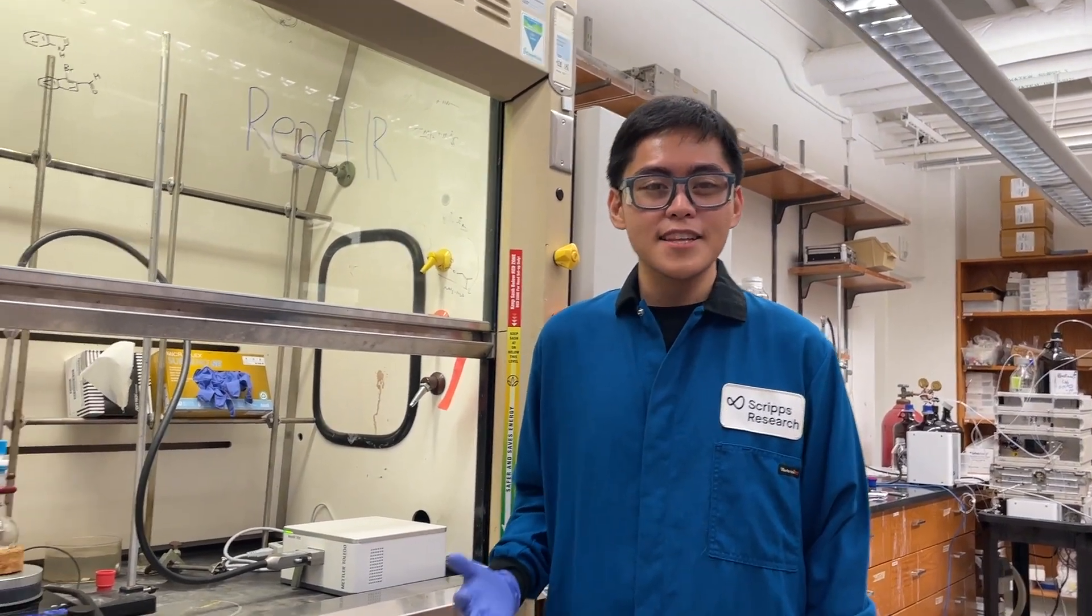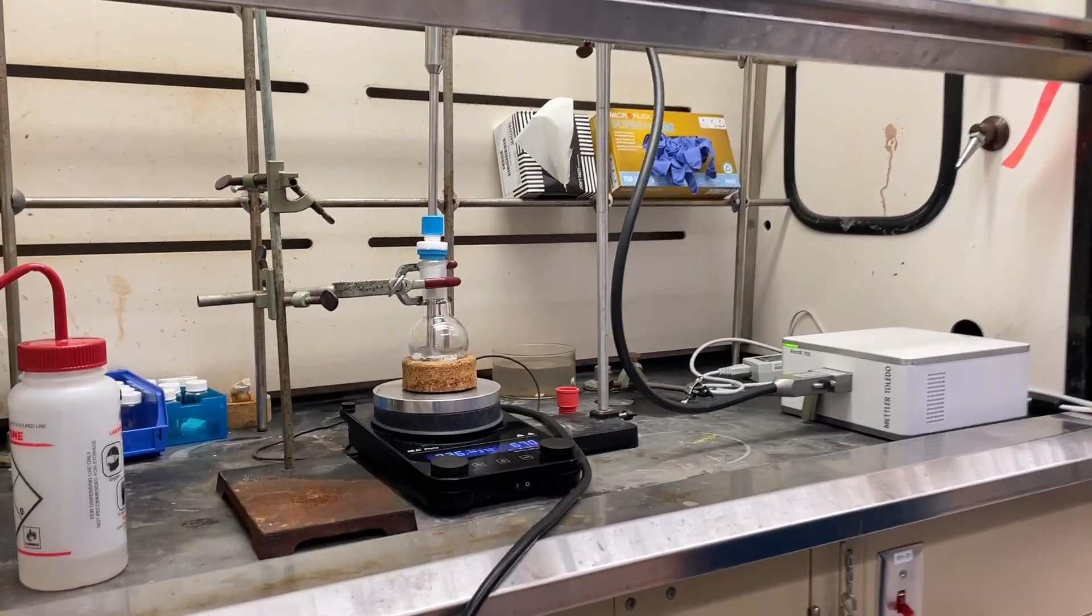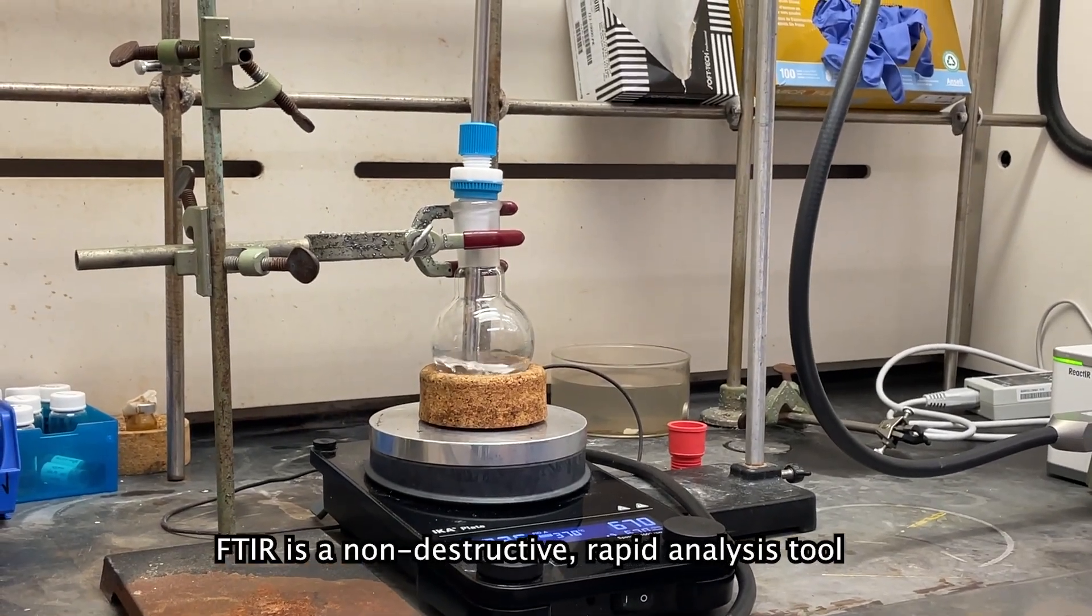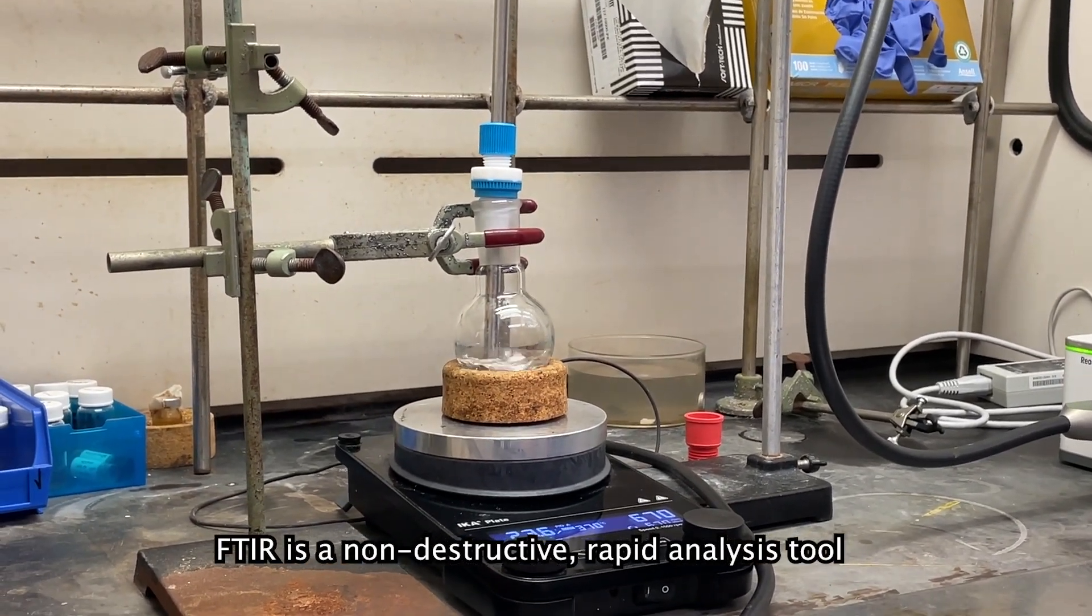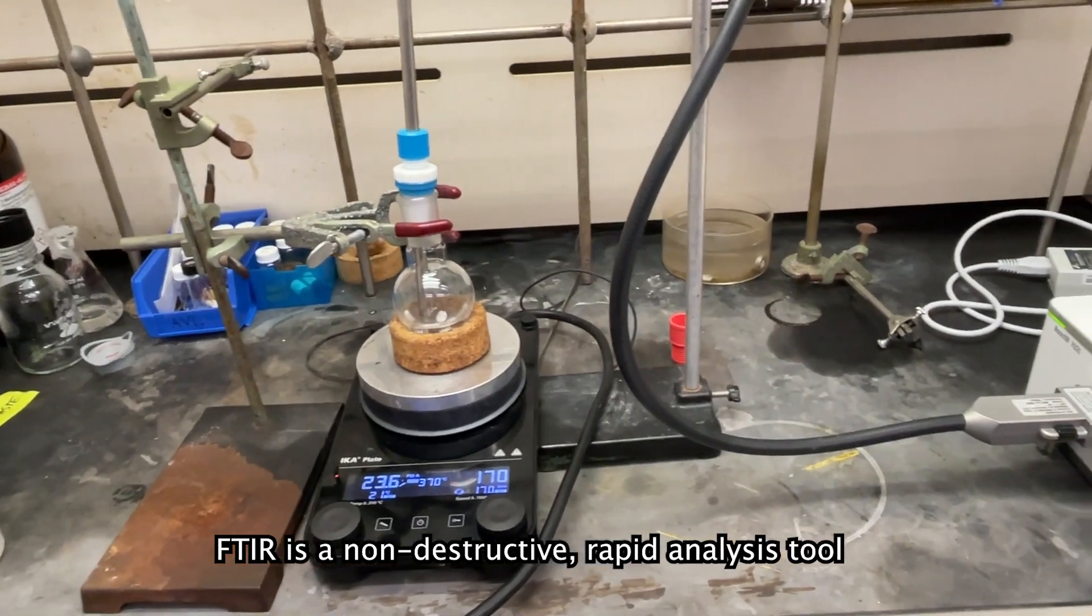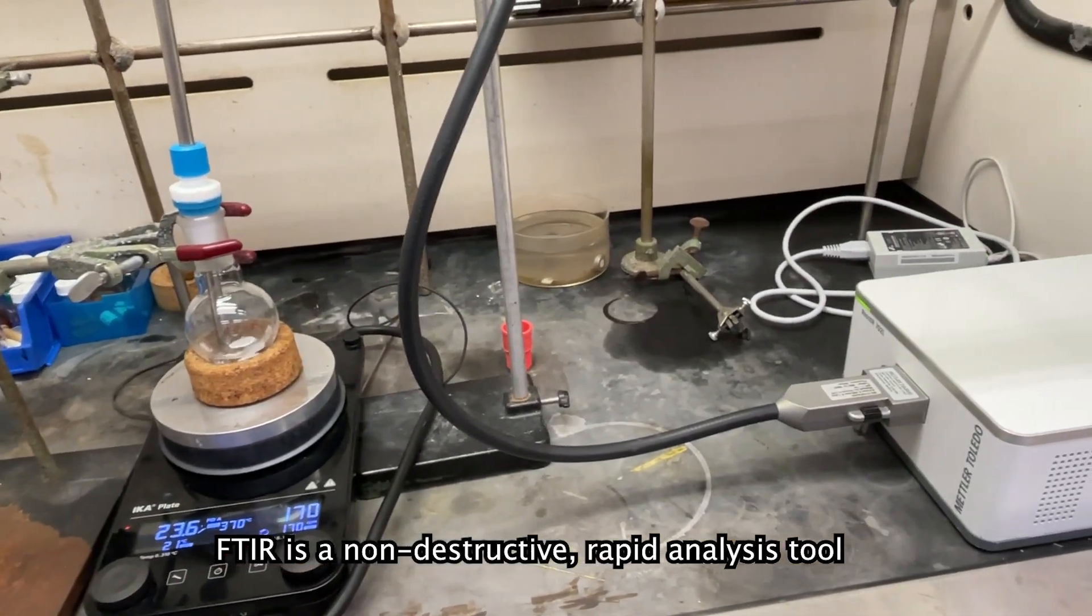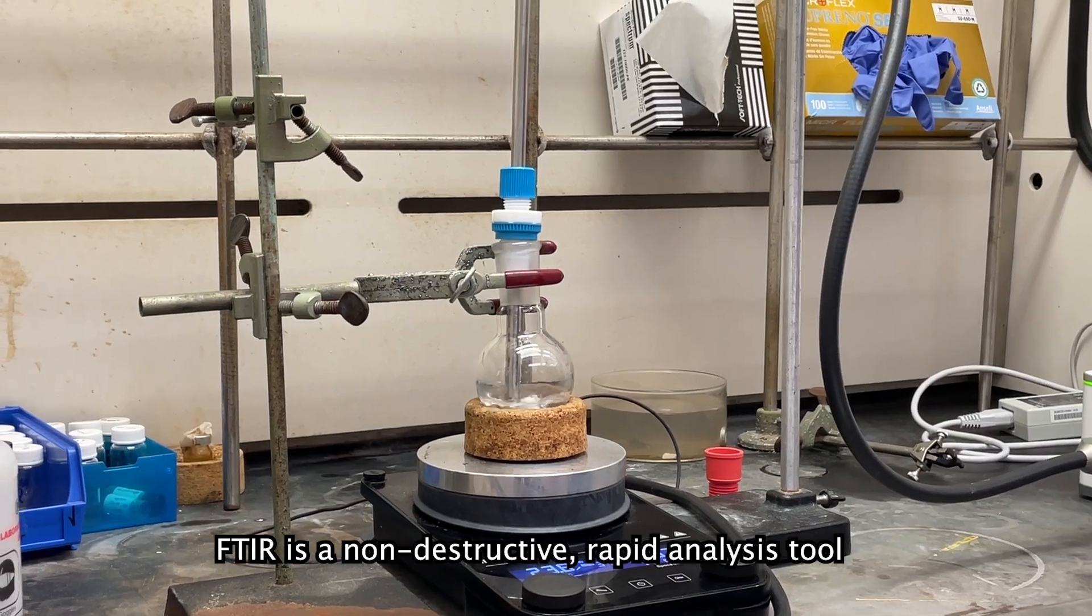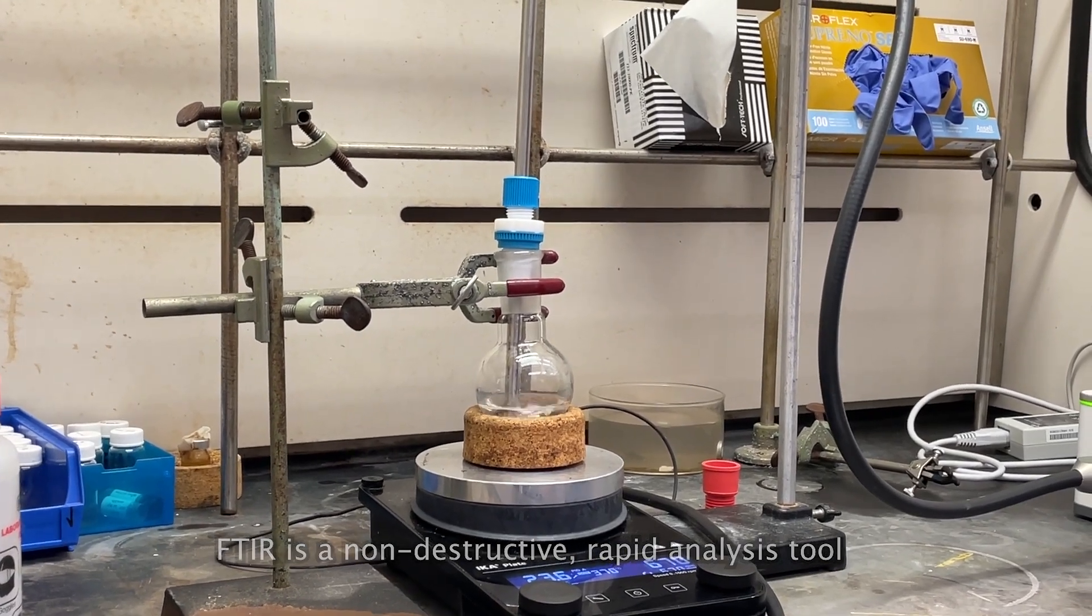So why would you want to use the React-IR in reaction monitoring? First, it is non-destructive. It doesn't alter the reaction while monitoring it. And being a rapid in situ method, you're also getting real-time data directly from the mixture. This can offer insights on some intermediates that you might otherwise not see through offline analysis.